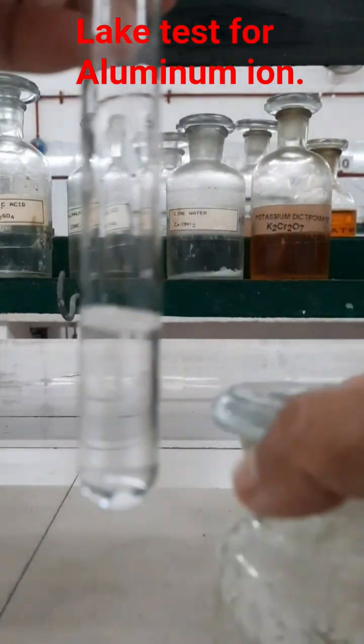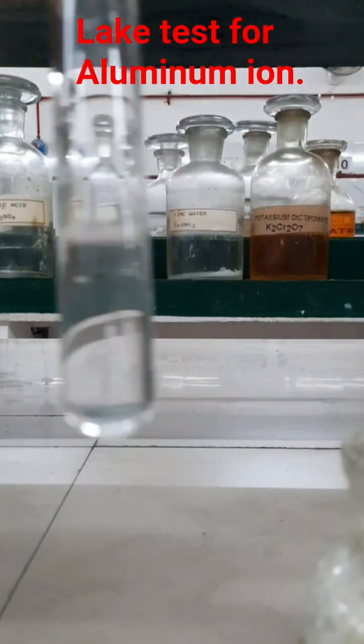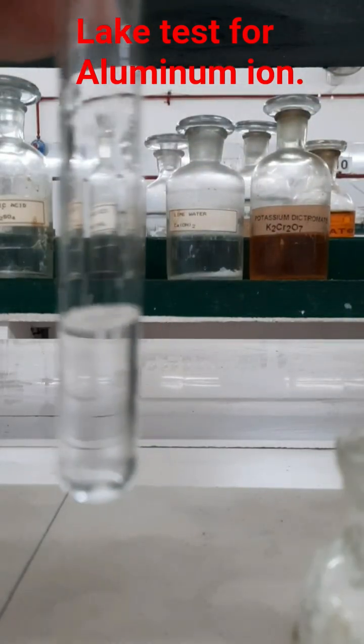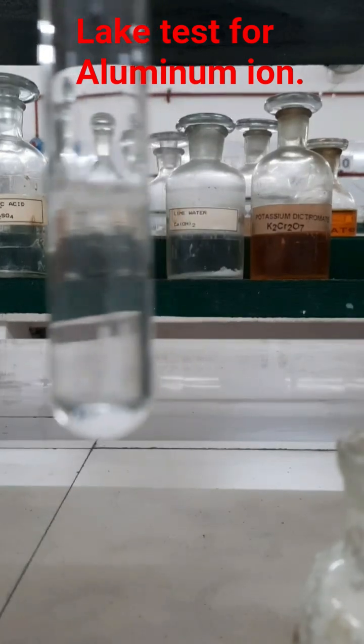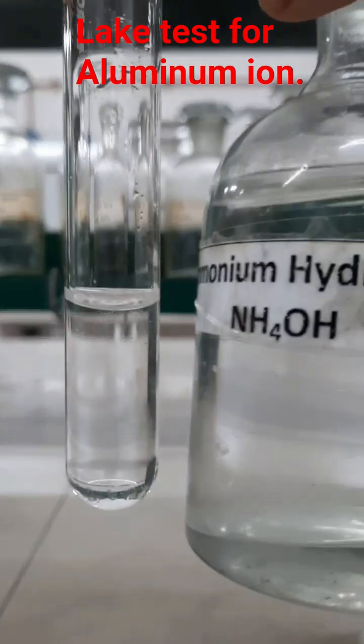Now you have to add the group reagent. First of all, you have to add a pinch of solid ammonium chloride salt into it and dissolve it completely. Then you have to add ammonium hydroxide solution into it.